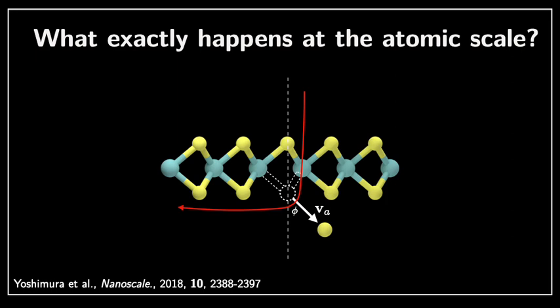By the way, I like this picture because it's really convincing that the atoms that actually sputtered are not the top layer, but the bottom layer. And I'm sure you can convince yourself of that. If you were trying to do that for the top layer, it would be very difficult to sputter it downward. I let your imagination figure out what would happen if you were trying to sputter the top layer atoms. So we are interested in doing this.